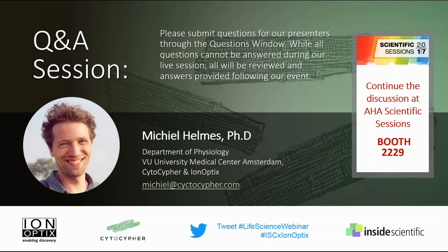In adult myocytes, it's easy because you have this very regular pattern, and you have some absolute data to go with. But even in the neonatal myocytes or stem cells, by looking at changes when you add a drug, you will be able to find whether there's an effect, and kinetics as well. So yes, you can use it even if you can't measure sarcomere length. You just have to adjust your thoughts and realize it's an assay and not an absolute measurement. Right, so basically just wider confidence intervals in that type of application, and that has to be worked into the scope of the project.